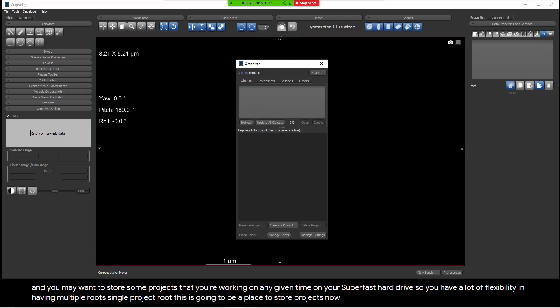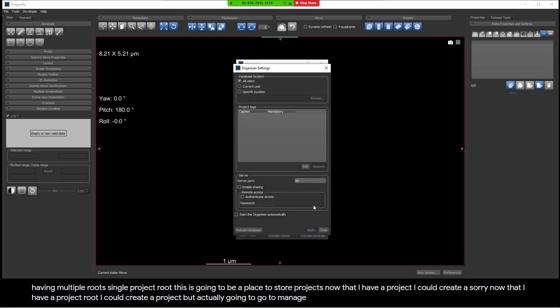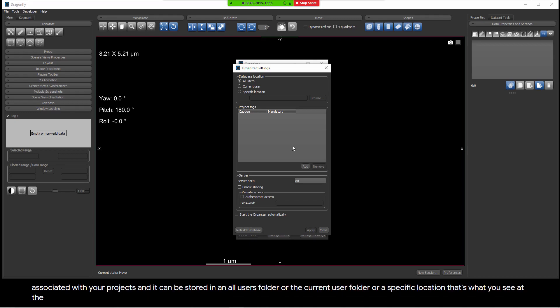Now that I have a project root, I could create a project, but actually, I'm going to go to Manage Settings first. There is a database that stores all the information associated with your projects, and it can be stored in an All Users folder, or the Current User folder, or a specific location. That's what you see at the top.